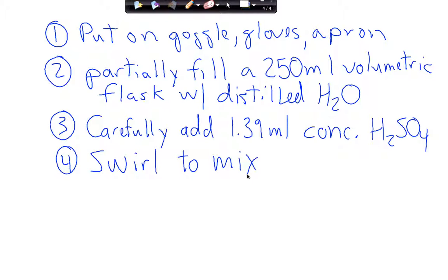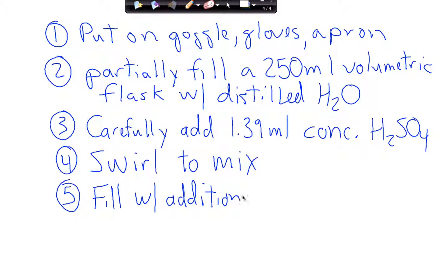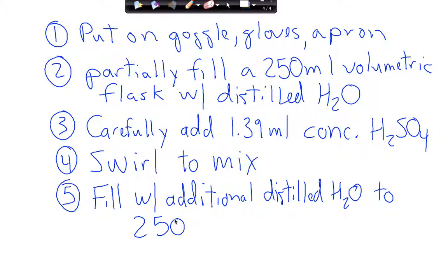Then, step 5, fill with additional distilled water to 250 milliliter line. That's what they're looking for, gang. In theory, no, it wouldn't be wrong if you put it, but you're okay if you don't.